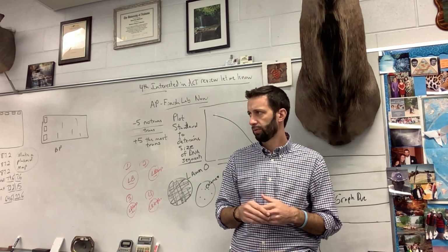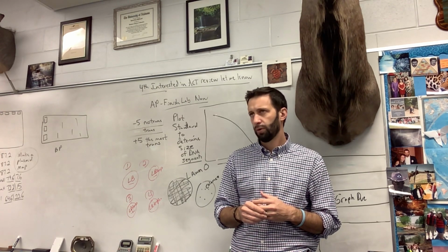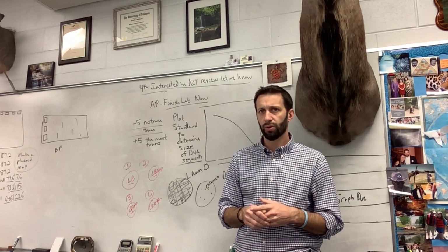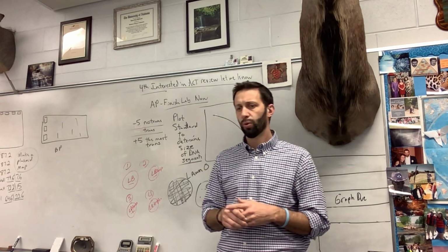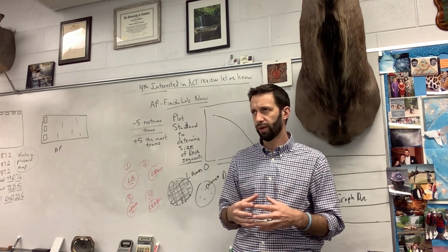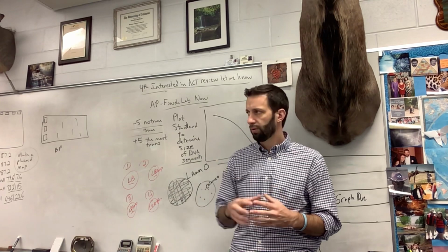Why colony? Because at this point it has more nutrition available to it, but it's not really more nutrition. The broth is nutrition. The sugar is needed in order to express the Pglo gene. So in order for it to fluoresce, it has to have that sugar. It's not really a nutritional thing for growing more bacteria.